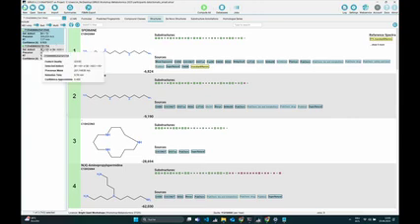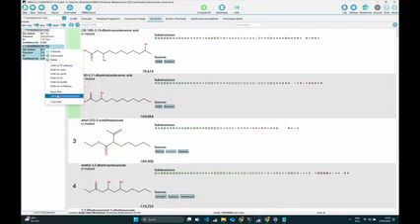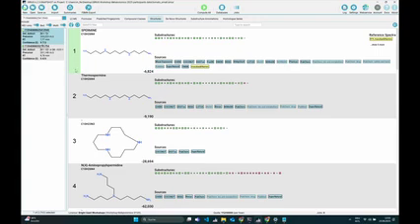Everything that we looked at before, so all the confidence scores we had, was the approximate confidence mode. But you can also switch to the exact mode, not only in the settings window, but also if you right-click on this. And here somewhere, we have used exact confidence mode. If we switch to this, it actually is really quick. And now we get the confidence score for the exact hit, which might be a little bit different. But what you will see now is that only one of the structures is highlighted in green. So again, like Markus said, exact confidence score really means how confident are we in the top annotation, the top 1 annotation, not in structures which are similar to the top 1.